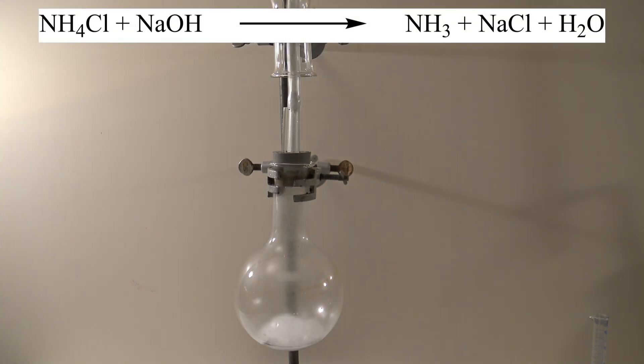The ammonium chloride reacts with the sodium hydroxide to form ammonia, sodium chloride and water. The gas is lighter than air and is collected in the upper flask.